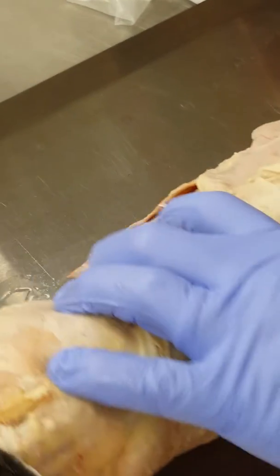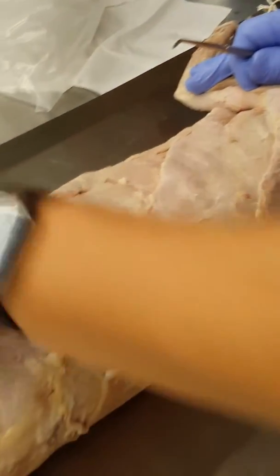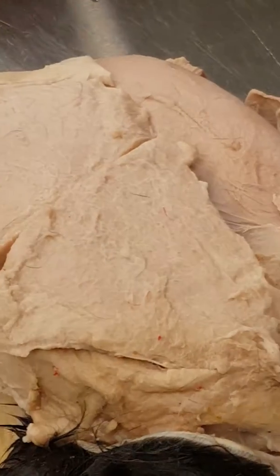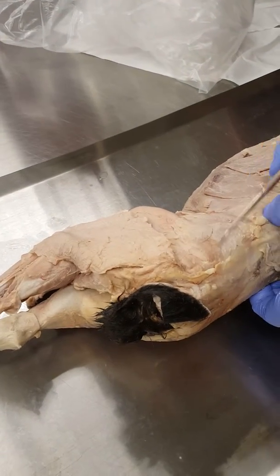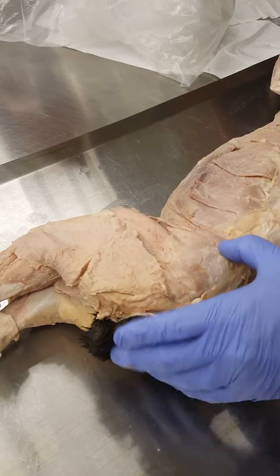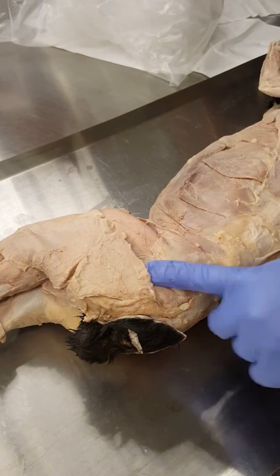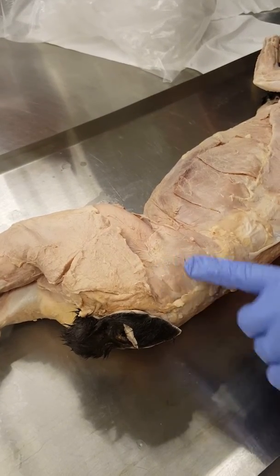Now for the legs, the idea here is you're going to see some gluteals, and your cat's pretty muscular, so it has a little bit of gluteals visible right here, right? And the key concept is the gluteals are actually coming off of the ilium, so you can feel the edge, the blade of the ilium right here, and the gluteals are coming off of the lateral surface of the ilium. So these are gluteals that you see right there.